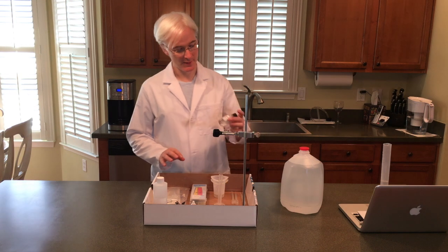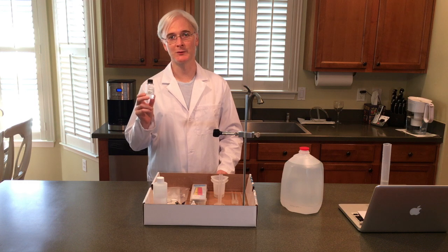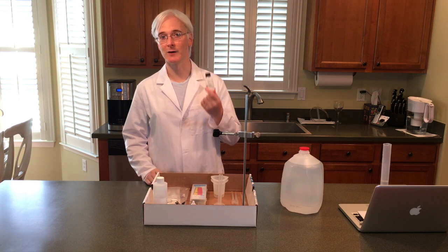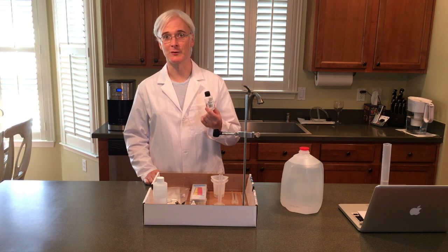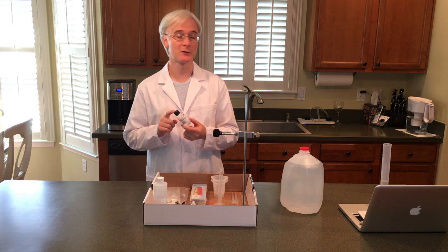The kit, when it comes, has sodium hydroxide in a concentrated 0.2 mole form. We need to dilute that down to 0.1 molar. We're going to need 60 milliliters of it in total for all the experiments in this course. So in order to do that we need to add another 30 milliliters — we have 30 milliliters here — we need to add another 30 milliliters of distilled water to that.